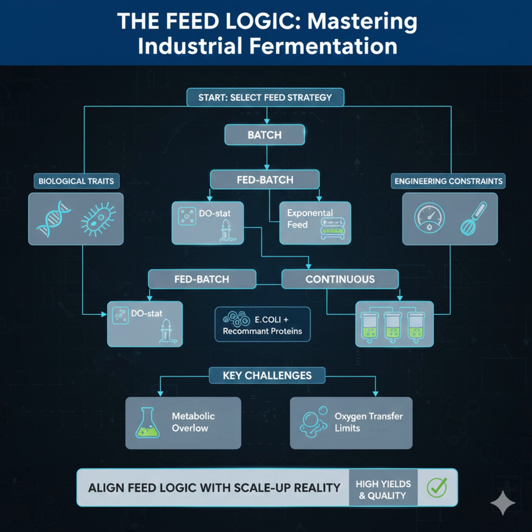That is exactly right. And tied directly to that is the third question, catabolite repression. For many organisms, especially in industrial fermentation, high residual glucose will strongly repress key metabolic pathways. Often the very respiratory pathways or secondary metabolic routes that you need for product formation. So if you have strong repression, you just cannot afford to have residual substrate floating around. The cell will literally shut down the valuable, energy-intensive machinery you're counting on. So tightly controlled, low substrate becomes a mandatory goal.